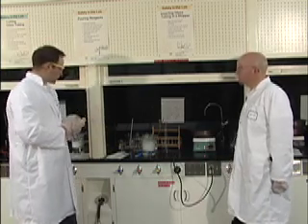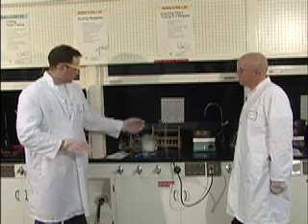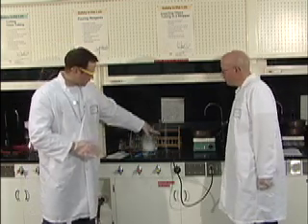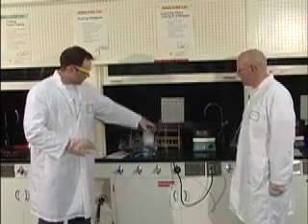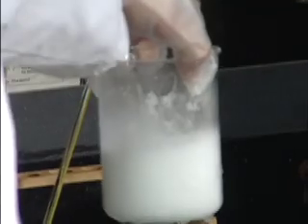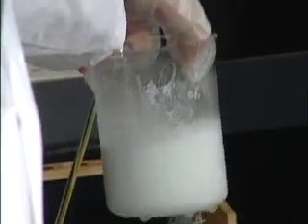I'm with you. And you'll notice that after your half hour, you'll come back and you'll have these beautiful needle-like crystals formed. Of course, Sherry has set this up for us already, so we already have basically a bucket full of needles. So it went from clear to a bunch of crystals.